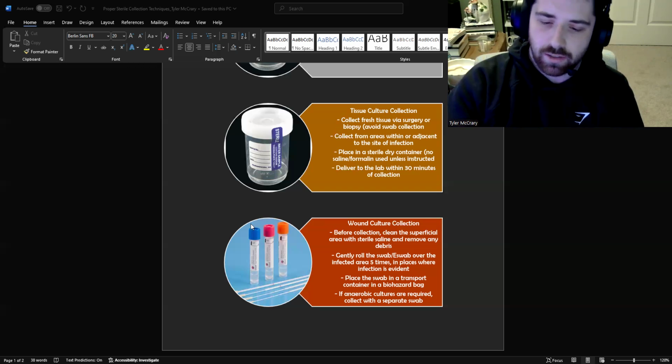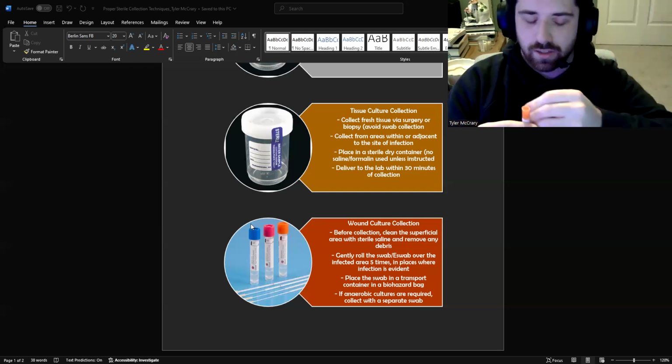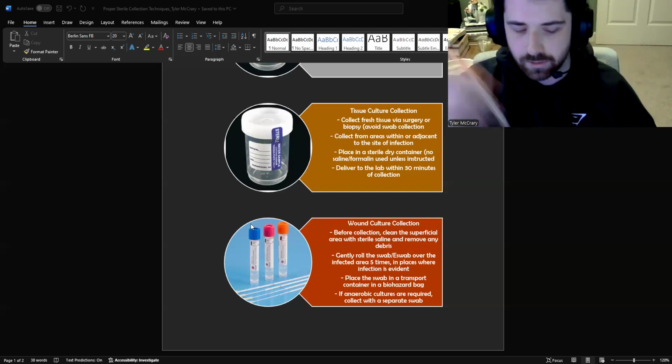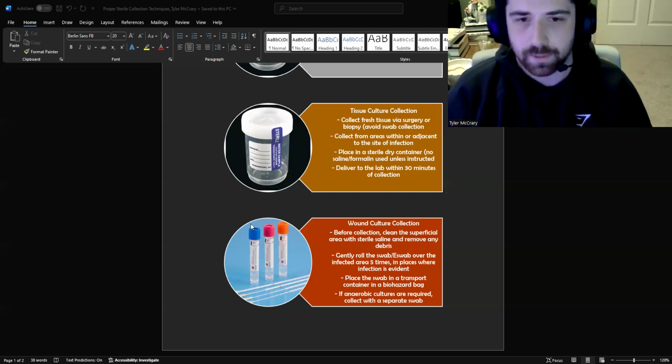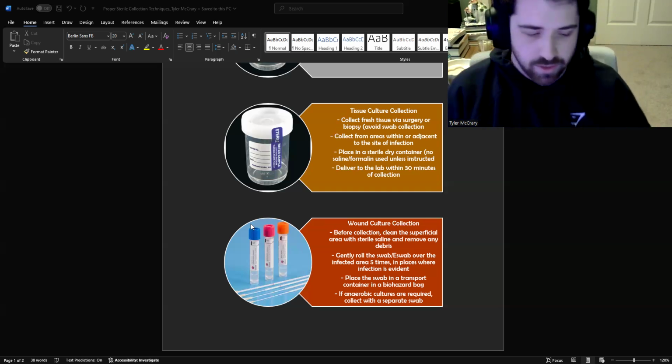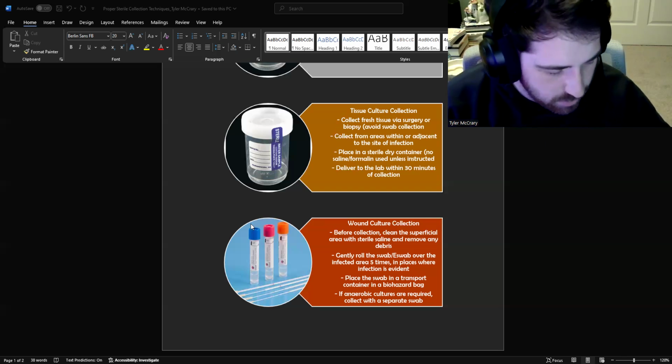And the reason we like to use these is because it has a diluent, so it's very easy just to stick your inoculating loop in there and then streak your plate directly from the diluent. There's no need to inoculate a broth and then wait a day and then you have to inoculate your plates. That just makes it more of a streamlined process.